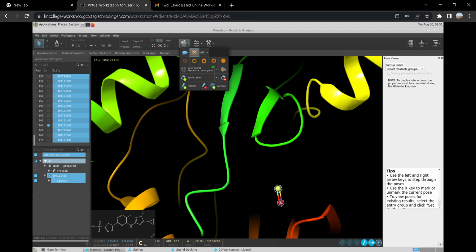Okay, in the meantime, I don't have much option but to show the docking analysis. That's a handout. You give it a try. I think if the result is over, then it's easy for you.